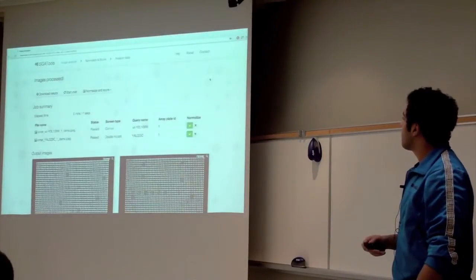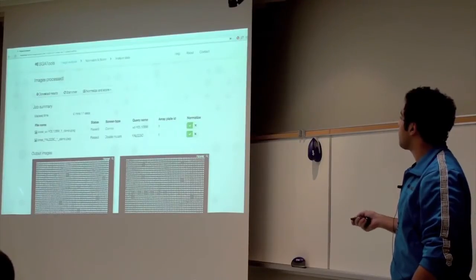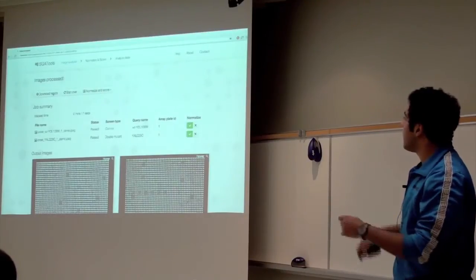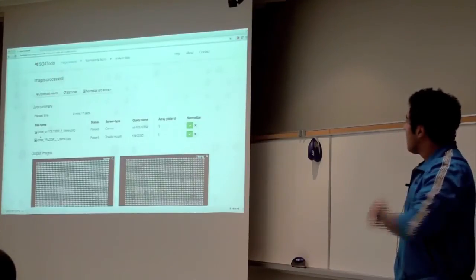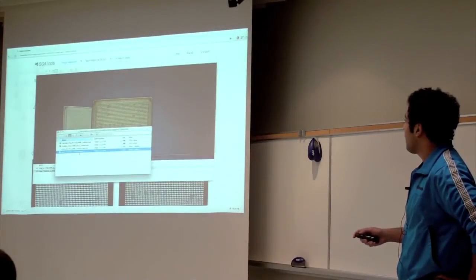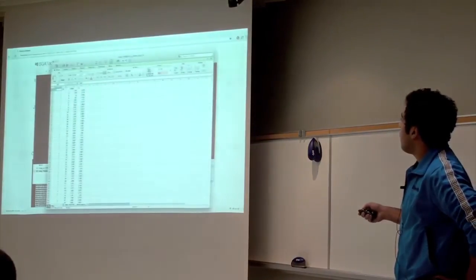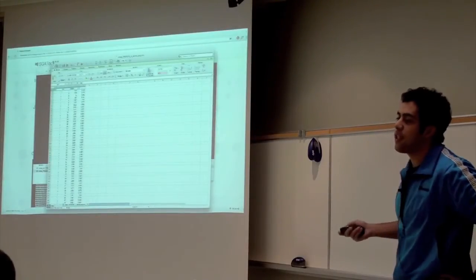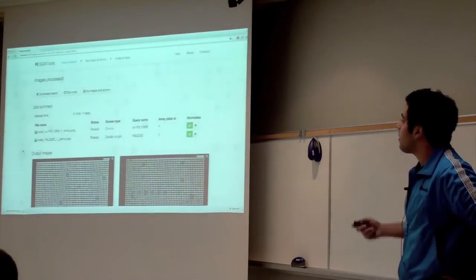So once these images are processed, you can download your results. You can visually inspect the image analysis that's been done on your images. So we're just going to go ahead and download the results, take a look at what it looks like. So you see, take a look at the Excel file that was spit out. It's pretty small, but you can see here's row, column, colony size, and this last thing is circularity. So really simple to use. You've got colony sizes straight out.